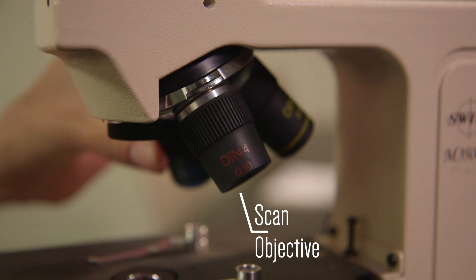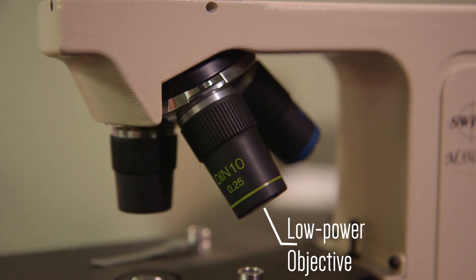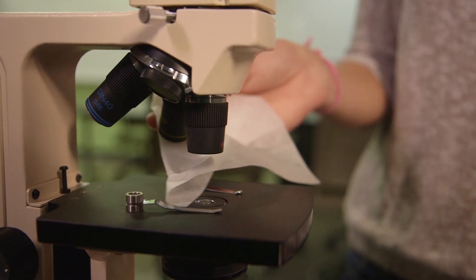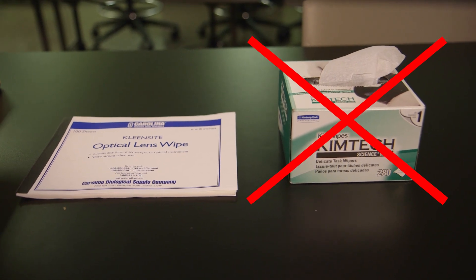The shortest lens is a scan objective. The one of medium length is a low power objective. The longer the lens, the more powerful the magnification. Clean the lenses with lens paper before you begin using the microscope. Never use KimWipes to clean microscope lenses because they will scratch them.